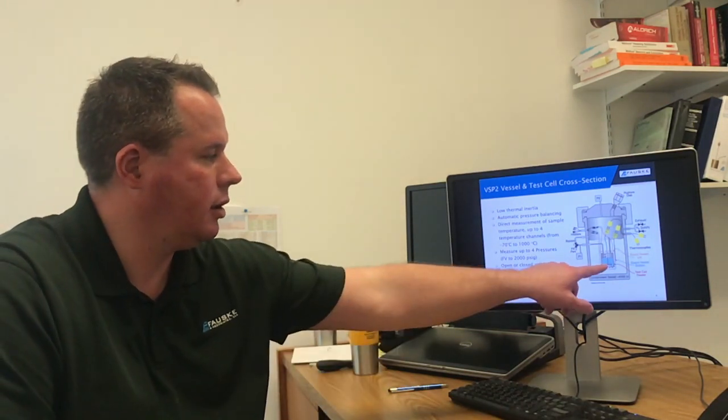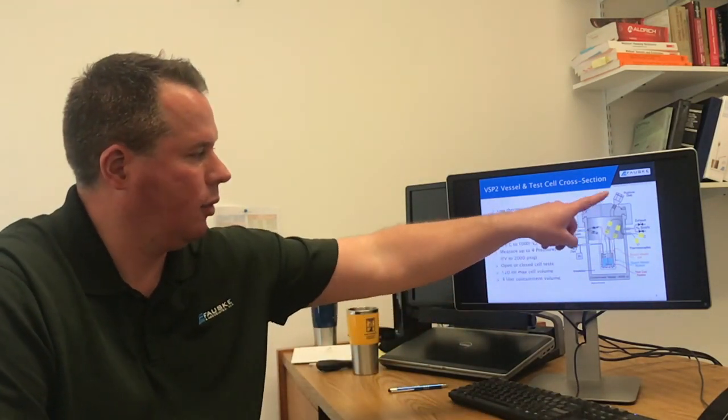And you can run open or closed cell tests depending on the system. A typical test cell is 120 mL. The test cell in this test is a 110 mL test cell. And it uses magnetic stirring, so there's a stir bar in the bottom. And this all goes inside of a 4-liter high pressure containment system.